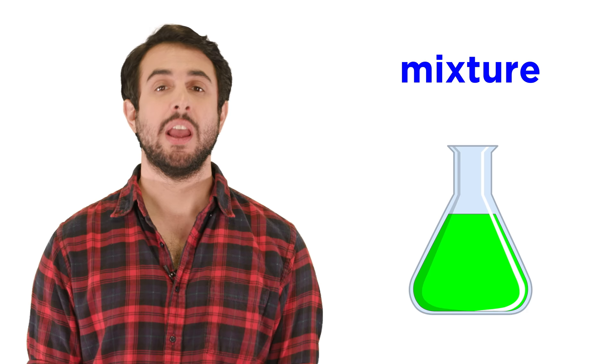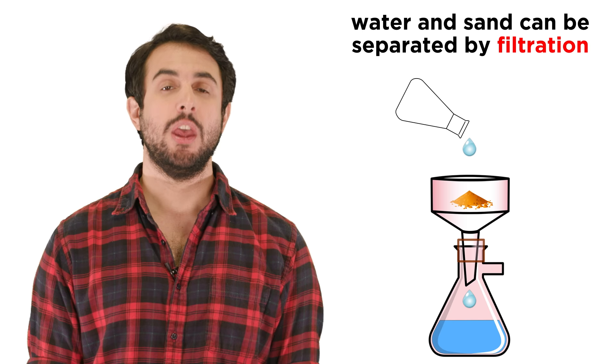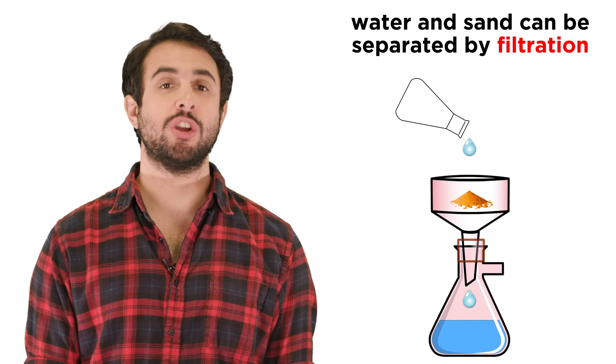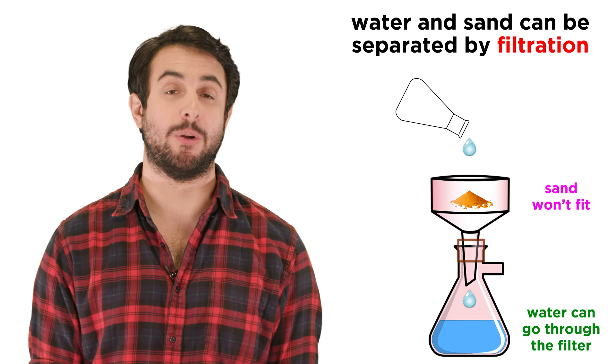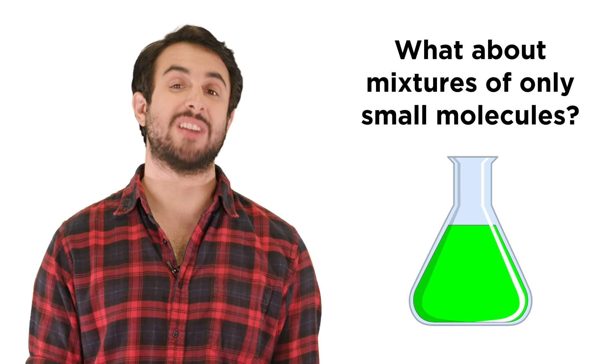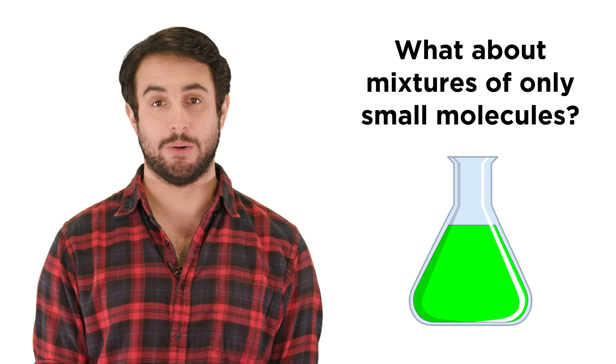If you have a mixture of some kind, sometimes it can be very easy to separate the components. With a mixture of water and sand, you can just use some filter paper, and the smaller water molecules will pass through the tiny pores of the paper, while the larger sand particles will not. But what if we have a mixture with several substances that are all small molecules?